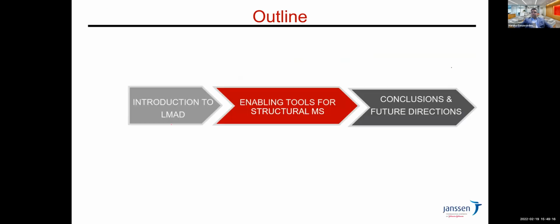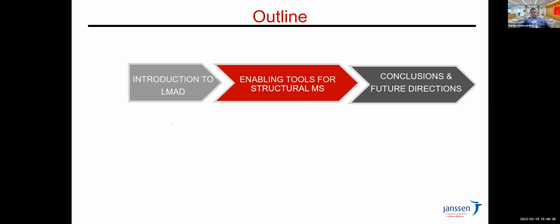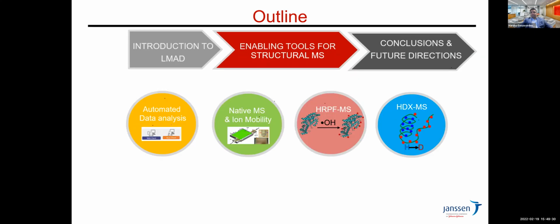This brings me to the main topic of my talk: structural MS tools and techniques that enable the determination of higher order structures of antibodies and antibody complexes. The topics I will cover are listed here.